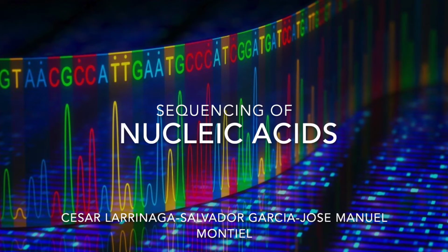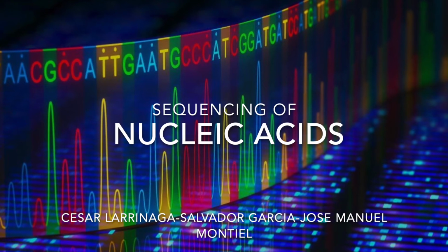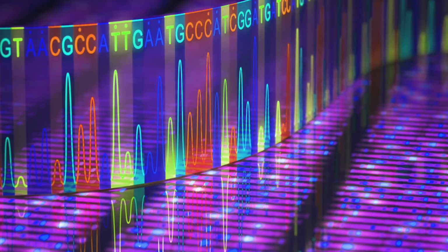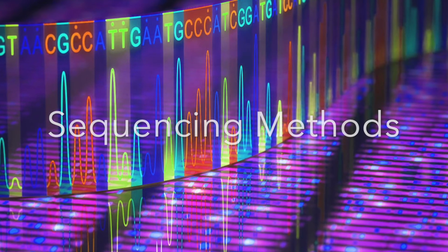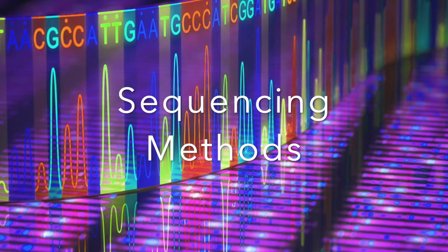The order that nucleotides have in DNA is called a sequence, and the techniques and methods used to know that sequence are called sequencing methods. Knowing the order of nucleotides is a tool with countless applications.